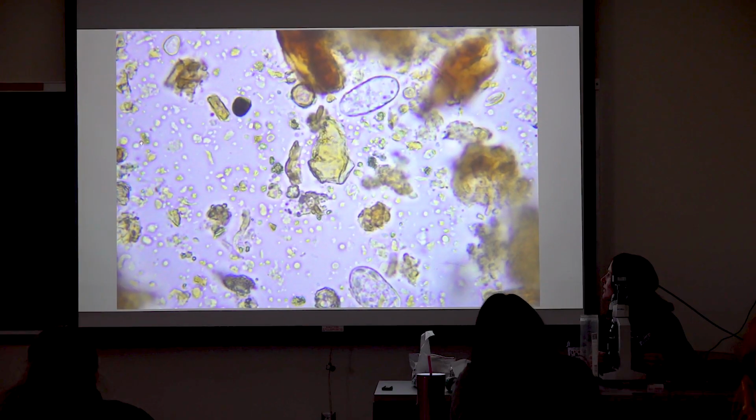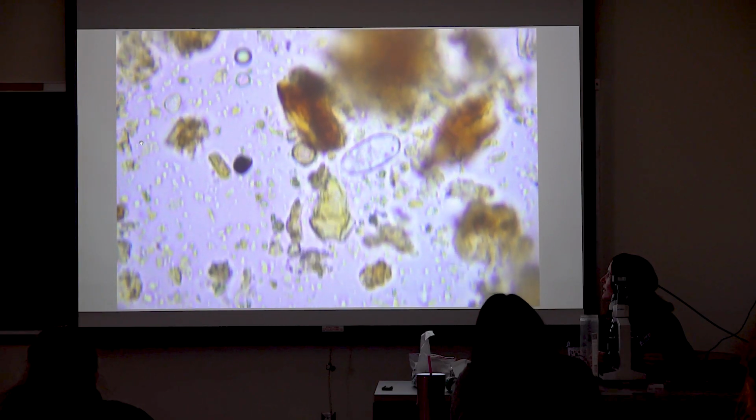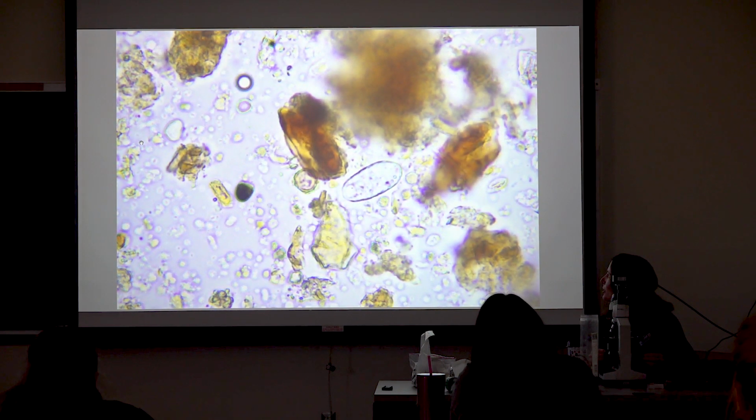I wish I could get my camera more in focus here. It's another testate amoeba. Oh, there you can see it's opening from a different angle, where it looks like a big round mouth, right? Yep, that circle in the end there.